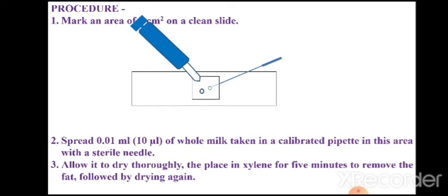Xylene is a non-polar solvent and it is supposed to dissolve fat. Therefore, that slide is dipped in a solution of xylene and it is kept there for 5 minutes. This treatment will be very useful for the removal of fat, and after that treatment the slide is again allowed to dry.